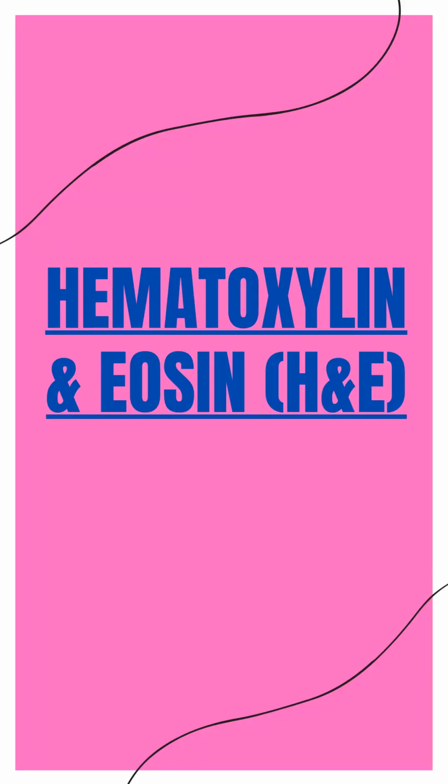Histology plays a vital role in understanding the microscopic structure and composition of tissues and organs in the human body. The study of tissues is facilitated by the use of various staining techniques, with hematoxylin and eosin, H&E, being the most widely employed stain in pathology. This educational video aims to explore H&E staining, its components, and the characteristic staining pattern it imparts, making it an indispensable tool for pathologists and researchers.